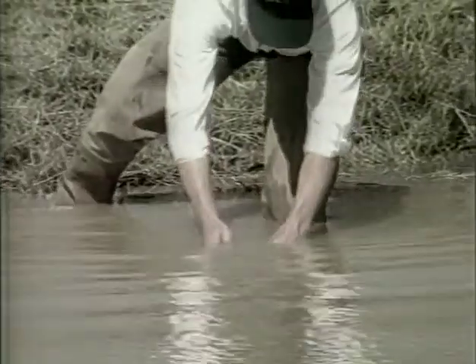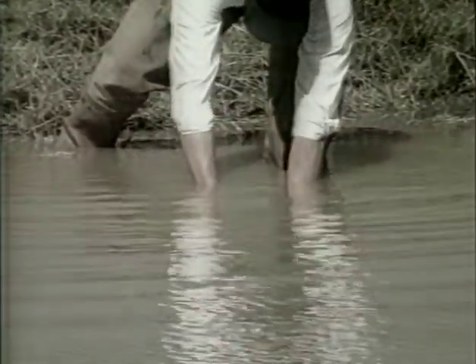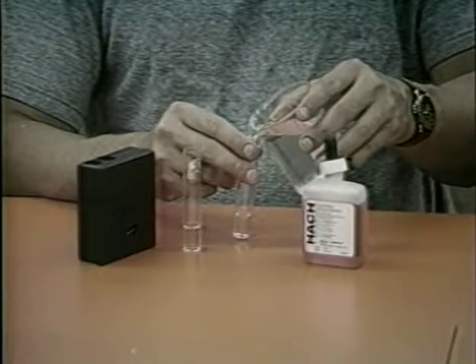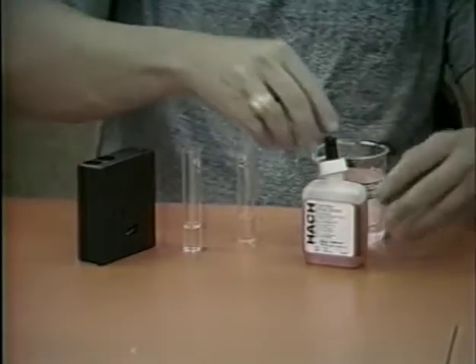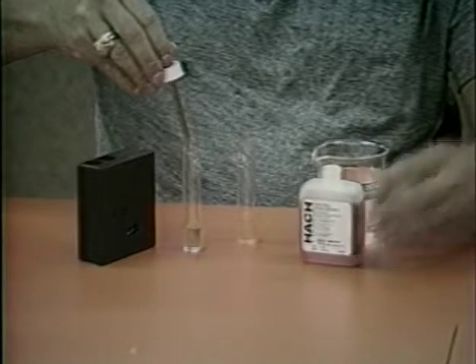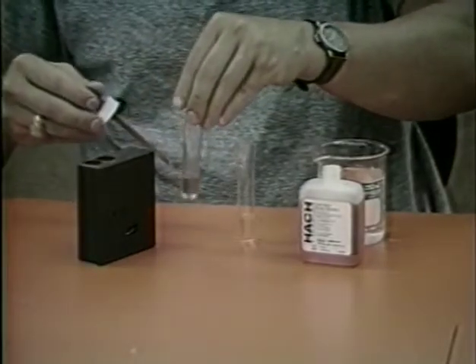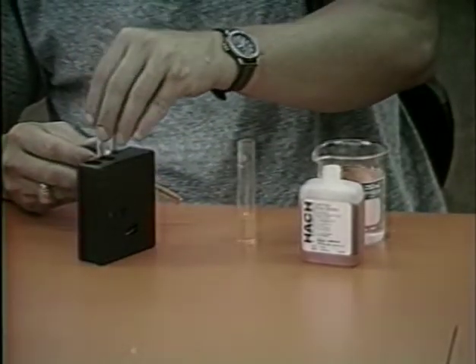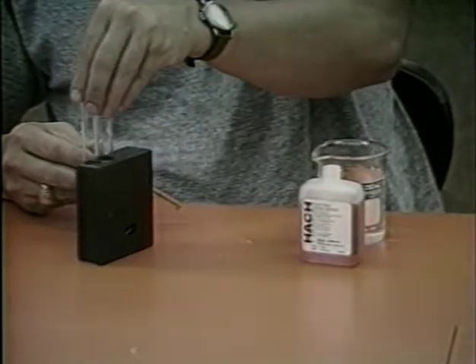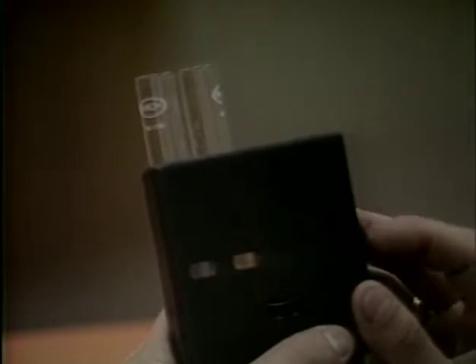Obtain a water sample as described for the wide range test. Fill the 2 viewing tubes to the 5 ml mark with the sample. Add 6 drops of the thymol blue indicator solution to one of the tubes and swirl to mix. Insert this tube into the opening on the right side of the color comparator. Insert the other tube into the left opening. Hold the comparator up to the light source and rotate the disc to obtain a color match. Read the pH from the wheel.